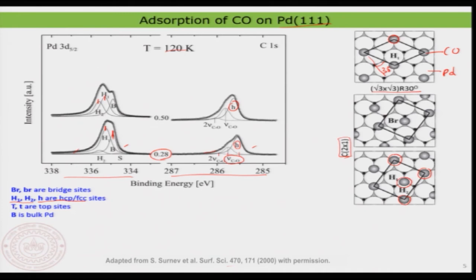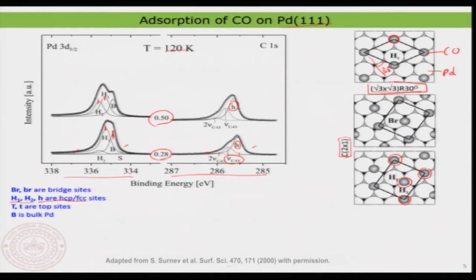Yeah, and then you also expect that since the concentration, so you can see this is at 0.5 ML, that means monolayer, you increase the concentration of the molecules on the surface, and therefore you are going to get a more compact structure. So, indeed, the C2x1 superstructure, or C2x1 adlayer structure, is more compact than this √3x√3 R30, for example. Yeah, so that's the interesting thing. Now we can continue the experiment.